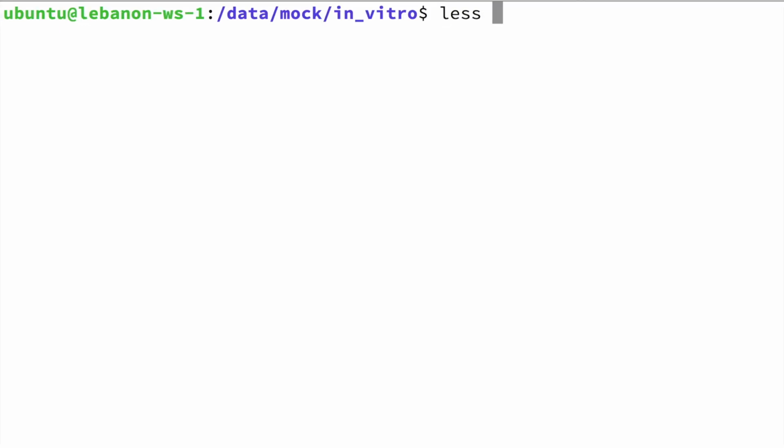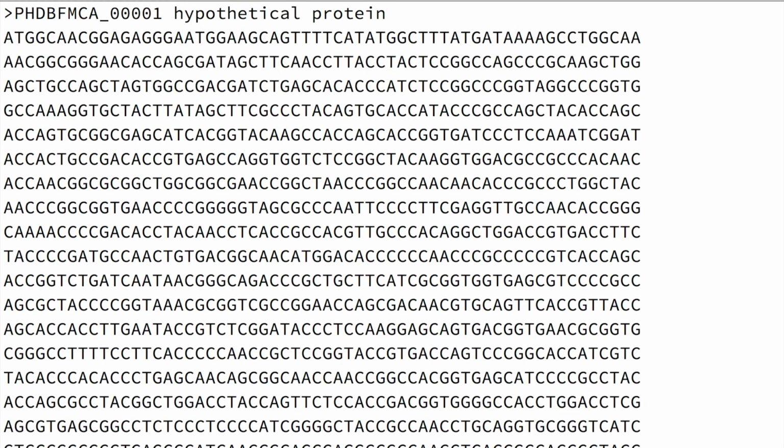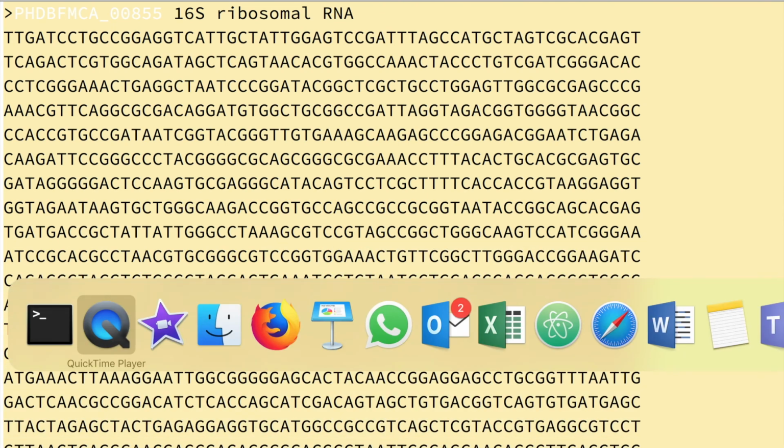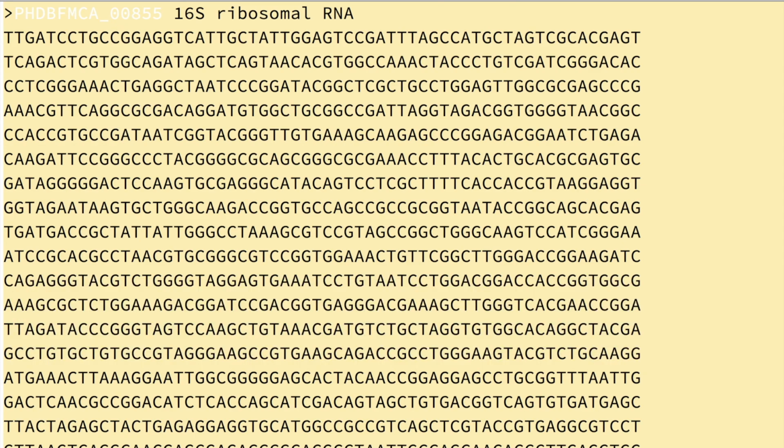So we can have a look at the annotation file ending with FFN, that is the FASTA nucleic acid format. So forward slash, let's paste the product, and we have one ribosomal RNA. It's possibly longer than this, but for the moment we can just copy a fraction, just to have a look at what's the output of a BLAST search.